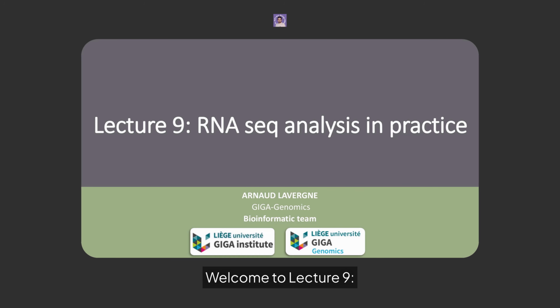Welcome to Lecture 9, RNA Seq Analysis in Practice. In this session, we move from theory to real datasets, following RNA sequencing from raw reads to biological interpretation, using examples from the GIGA Genomics Bioinformatics team.